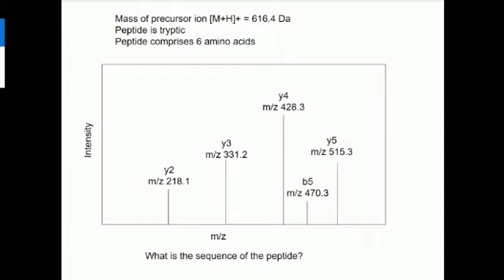I'm going to go through it because there are a couple of things that I want to point out in it. Right, so again, it's a tryptic peptide, so we know this is lysine or arginine. But we're going to be troubled this time because we haven't got the full run of Y fragments. But we start off with the Y fragments. Always use the Y fragments where you can. Okay, so we've got the Y5, which is this one.